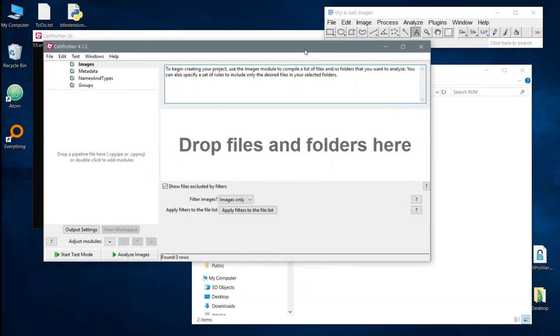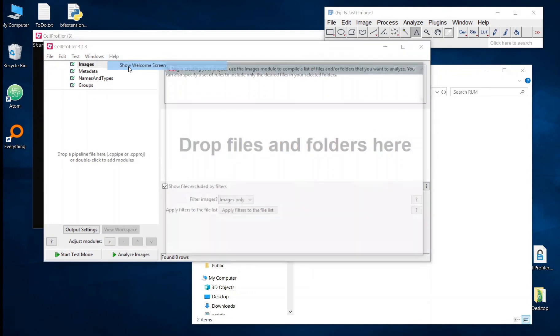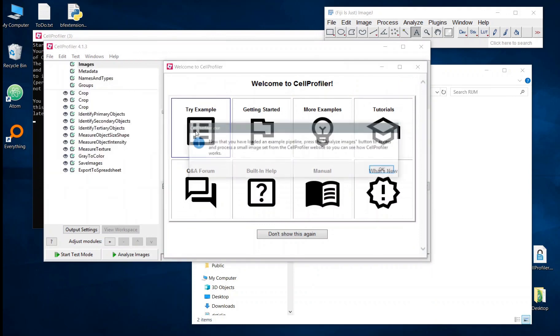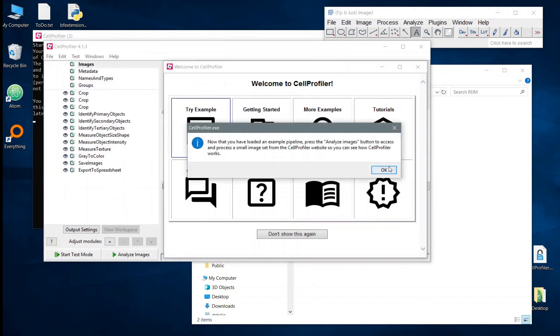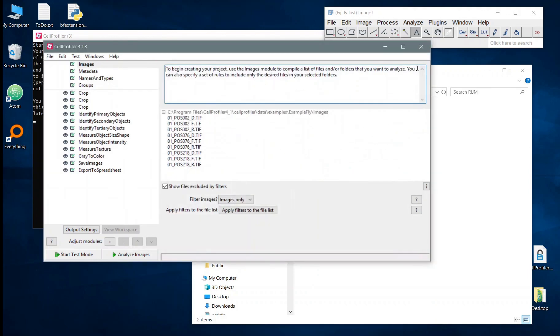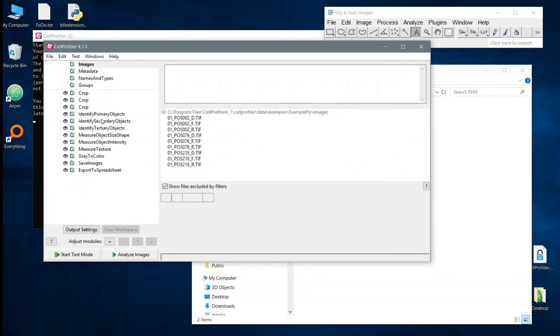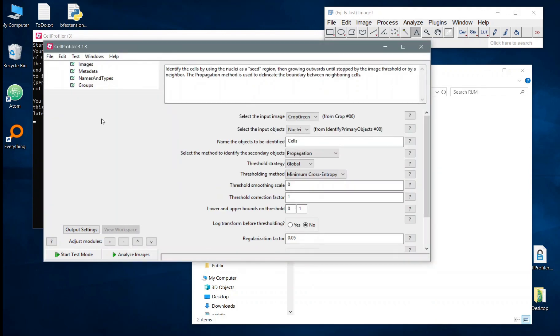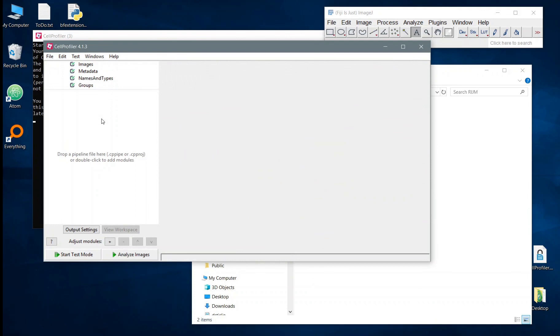Hi everyone. Today we're going to be looking at the new RunImageJ macro module introduced in CellProfiler 4.1. I'm going to start by just opening up some example images in the example pipeline and clearing off the modules that we have there.